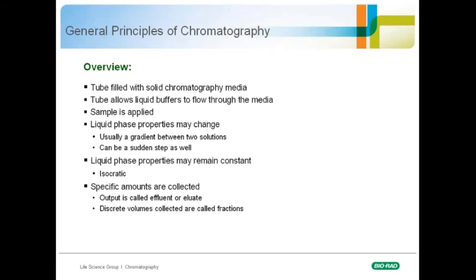During all this process, we would be collecting what is called effluent or eluate. This is essentially what we are separating in terms of the mixture components, one from another. And when we separate these out, we do what is called collecting fractions.